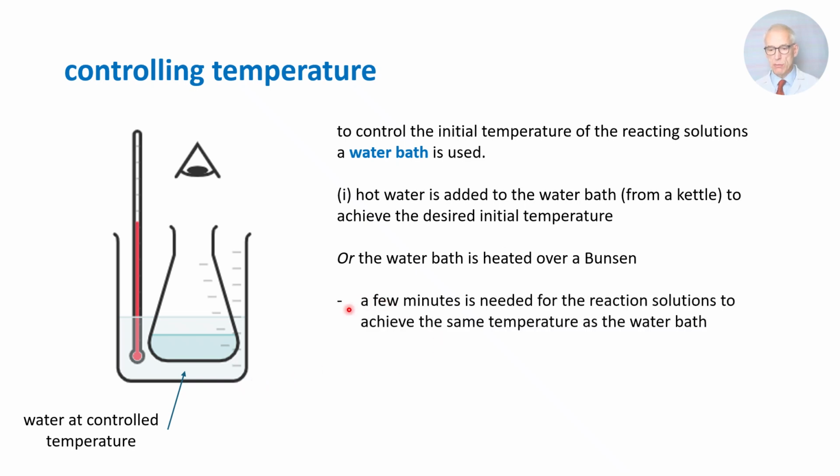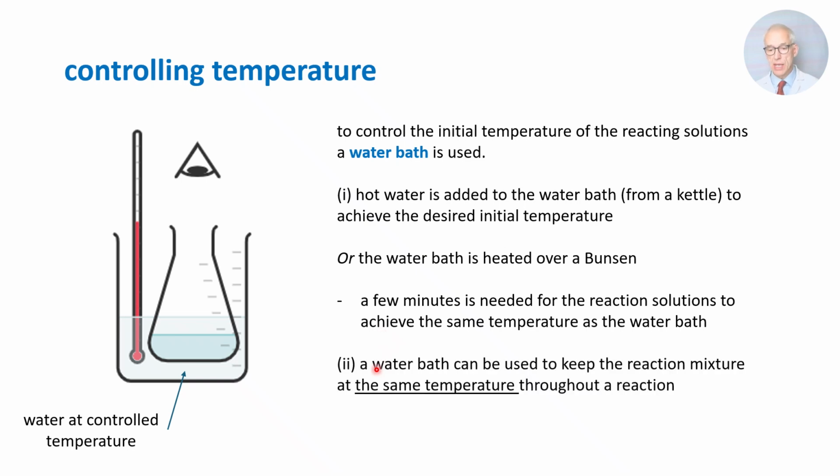Bear in mind that a few minutes is needed for the reaction solutions inside the conical flask to reach the same temperature as the water in the water bath. So that's something to consider in writing a method.